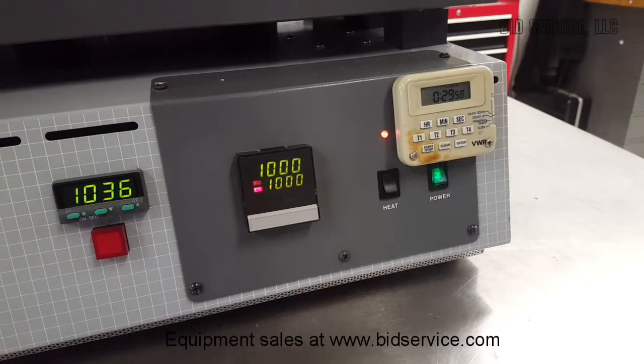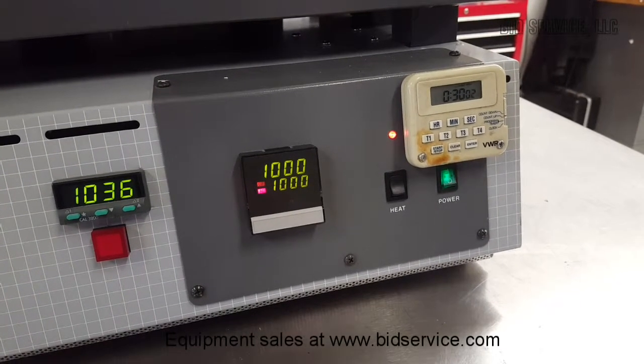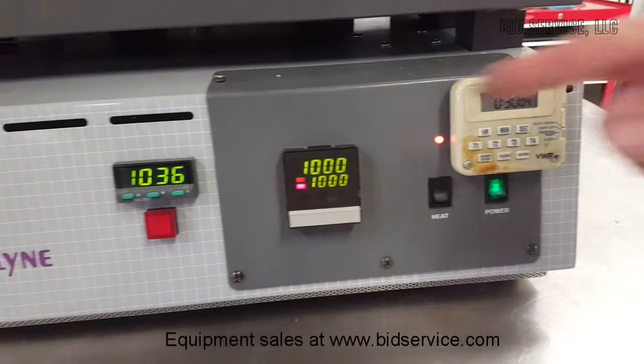Here we are at exactly 30 minutes. It held at a constant temperature of 1,000 degrees.